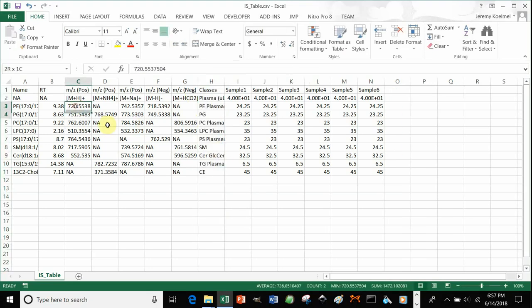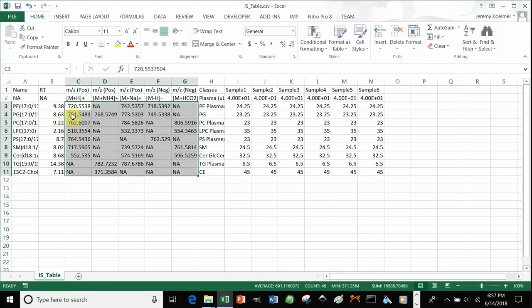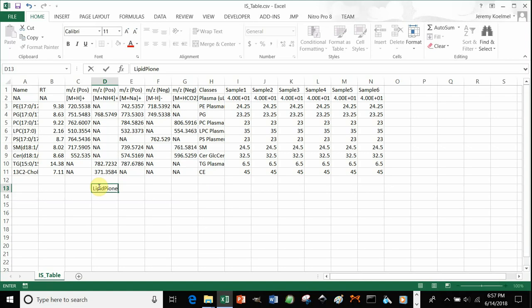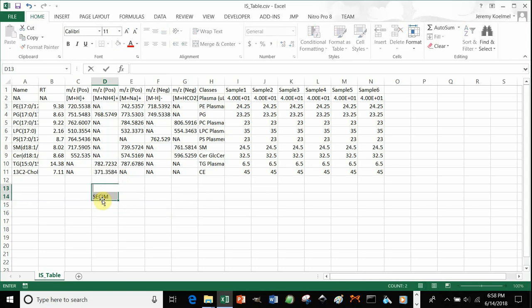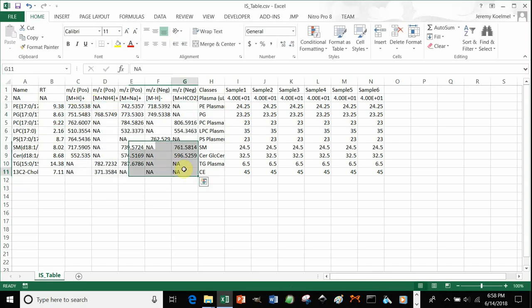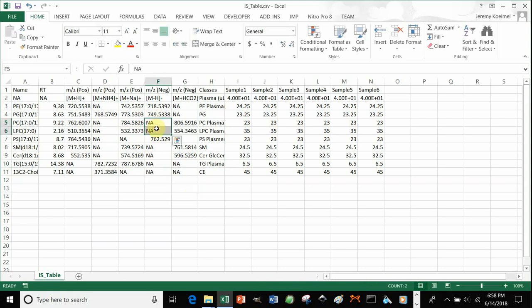In order to calculate the masses of your internal standards for each of those adducts, you can use Lipid Pioneer — a tool developed in Bowden's lab, found at the SECIM Tools webpage. Type 'SECIM' into Google and you'll find it. In that tool, you can type in the name of your internal standard and it will show you the masses of each. You'd paste those masses here. If you don't know the mass of an adduct, or you don't expect that adduct based on your chromatography, you can place an 'NA' where that mass would be.